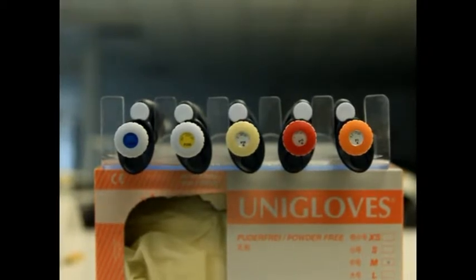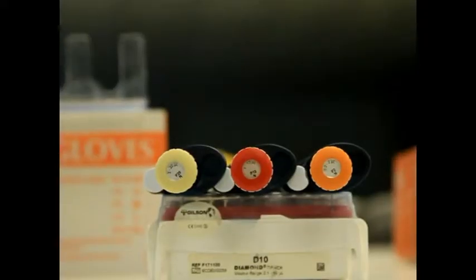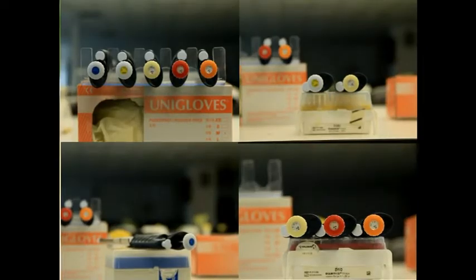There are 5 different kinds of pipettes in our laboratory, each with its own kind of tip, and each pipette is designed to transport a specific range of volume. The tip in a large blue box fits the P1000. The tip in medium-sized box fits the P100. The tip in the smallest box fits the P20 and P10.